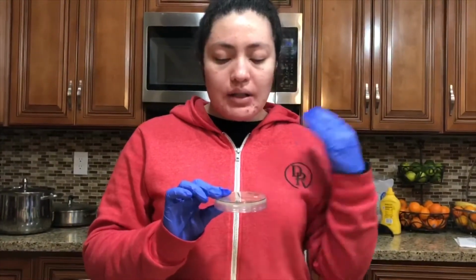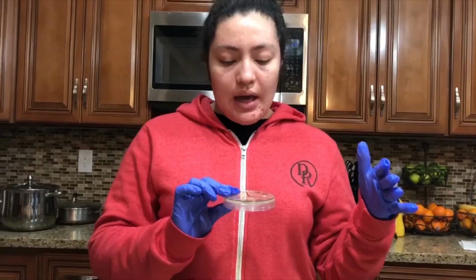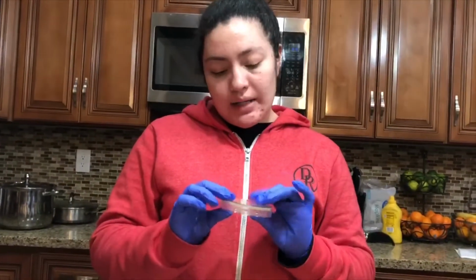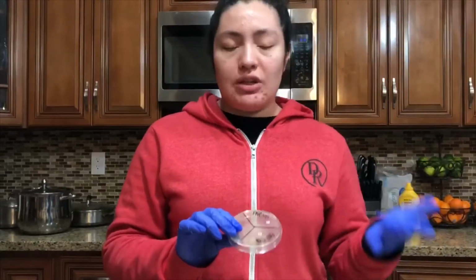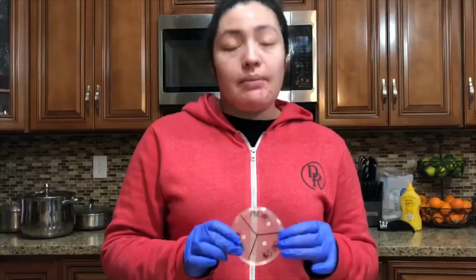My hypothesis stated that novobiocin and penicillin would show inhibition, and that gentamicin would not. So my results are partially correct, not the ending, just because gentamicin did show a zone of inhibition. So yeah, that's my results. Thank you.